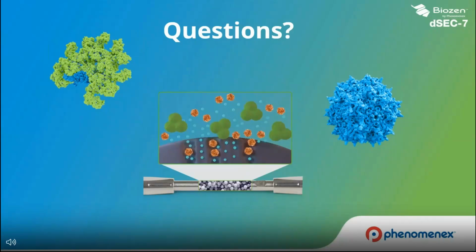Beyond that, if you go much, much higher and start squeezing these samples through narrow capillaries, I'm not so sure. But if you were to run a 4.6 by 15 or 30 centimeter column, 0.5 mL per minute should not be creating or reducing any other species that's not already inside your sample.